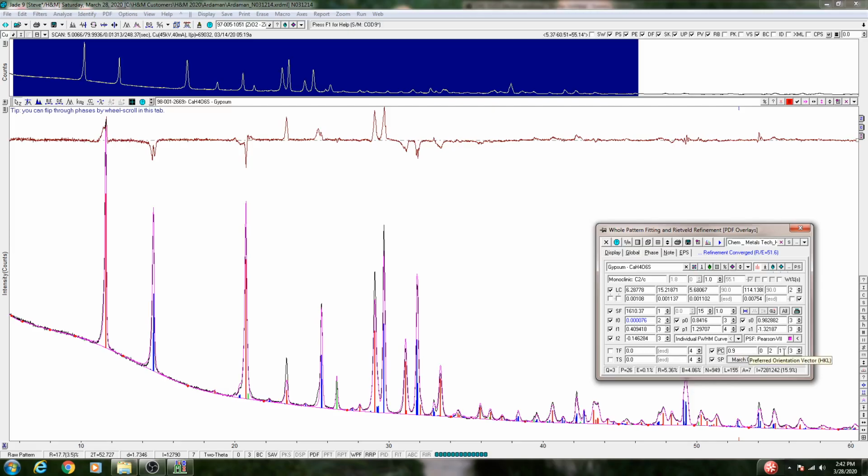021 was that expected primary reflection, which is this reflection. But the preferred orientation is really probably in this 020 direction. So we're going to want to fix this and change this to 020. Okay, and then we're going to run our refinement again.